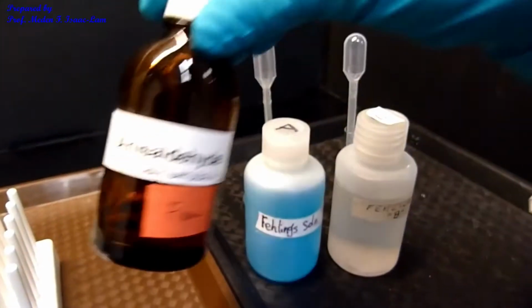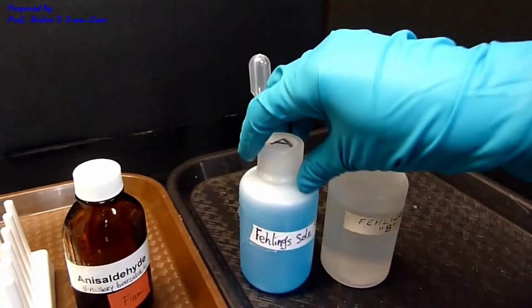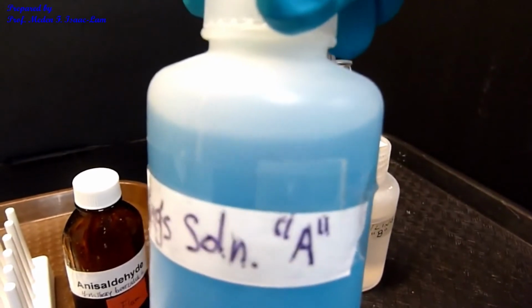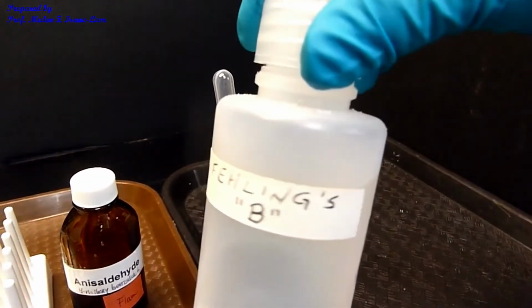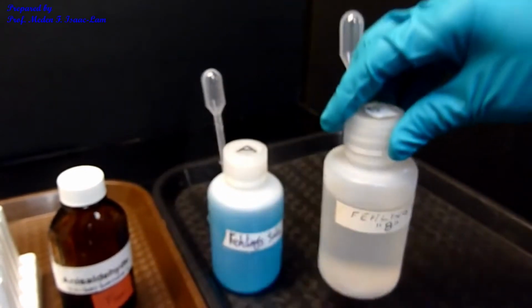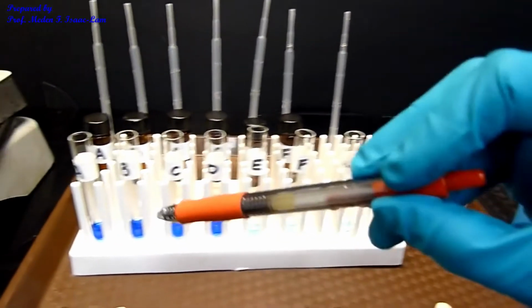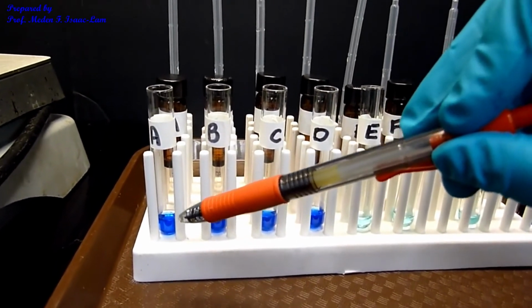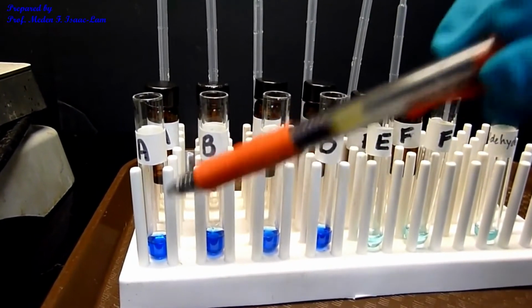So I now have a standard, anisaldehyde, which is an aldehyde, and the reagent is Fehling's A solution. Fehling's solution A is copper(II) sulfate, it's blue. And then we have Fehling's B solution, which is basic because of the potassium hydroxide. I already mixed together Fehling's solution A and Fehling's solution B in the tubes for the unknowns A, B, C, D.